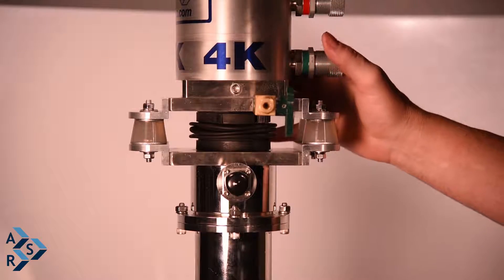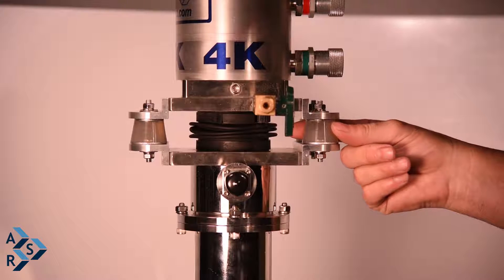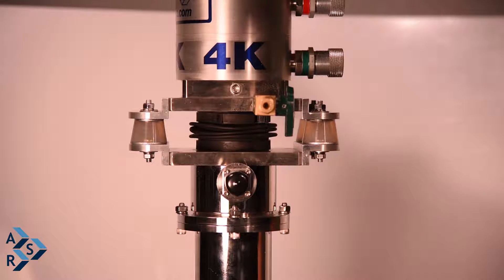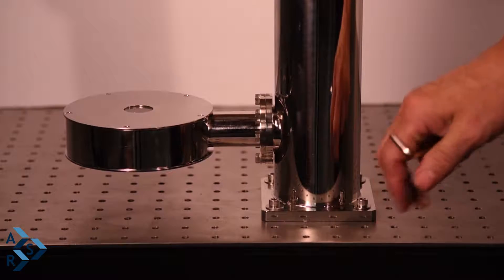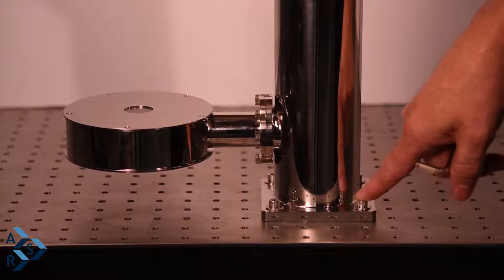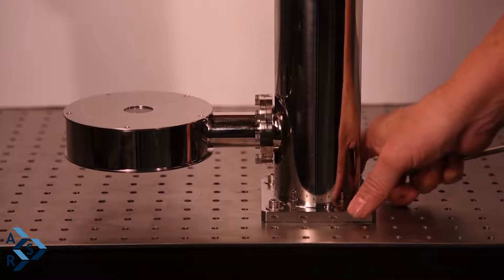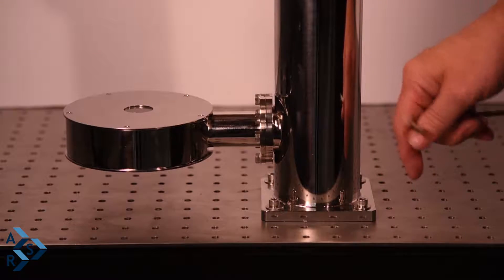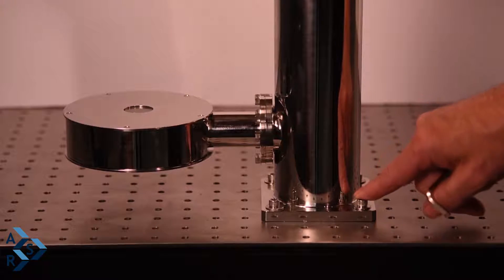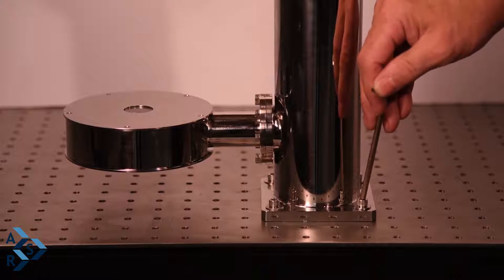This is one way of setting up the system. Most breadboards use quarter-20 fittings, so we have stainless steel socket head cap screws, and the way our flange is designed is to actually mount on the breadboard. What we normally do is tighten these screws in hand tight first and then back them up with the Allen key.